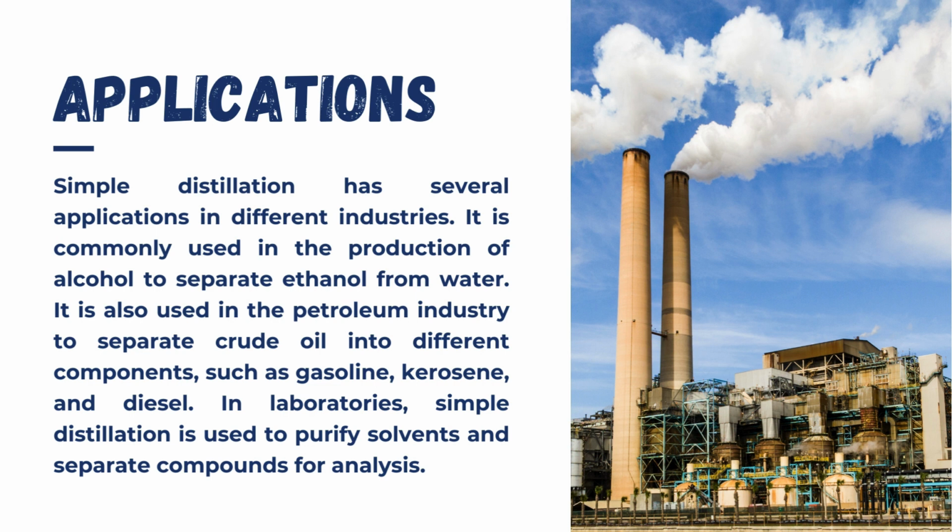Then in the world of oil, like in petroleum industries, it's the go-to for breaking down crude oil into its different parts. Think gasoline, kerosene and diesel. And you all know those busy labs, simple distillation is like the superhero. They use it to clean up the solvent and tease apart different compounds, making them all squeaky clean for analysis. So guys, these were some of the applications of simple distillation.